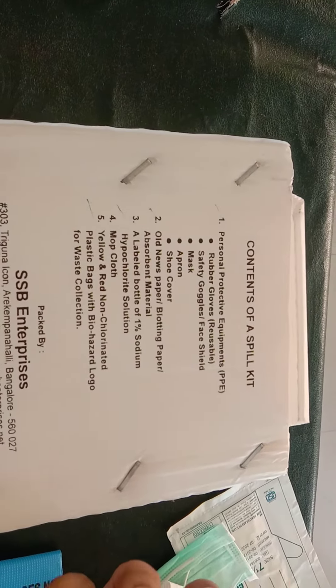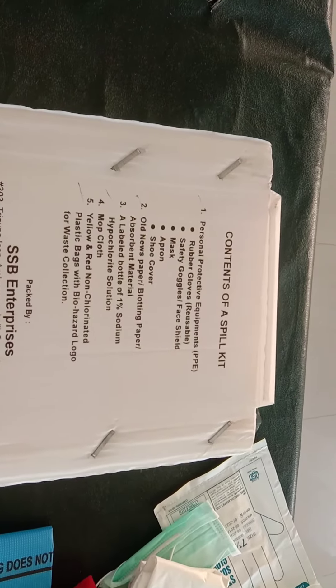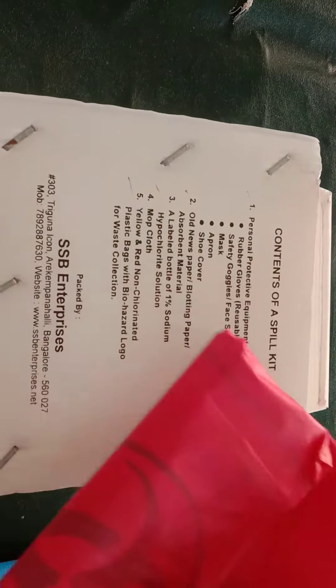Other materials include old newspaper or blotting paper as absorbent material, a labelled bottle of 1% sodium hypochlorite solution, a mop cloth, and yellow and red non-chlorinated plastic bags with biohazard logo for waste collection.